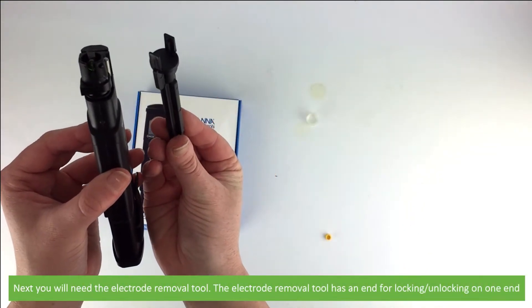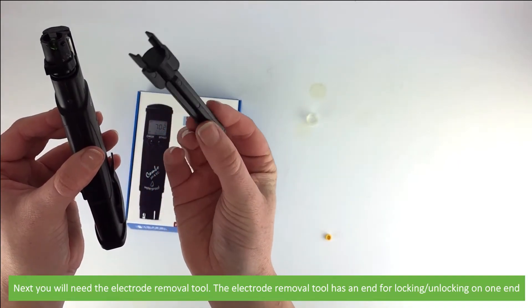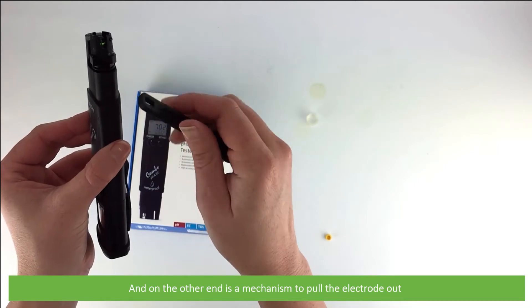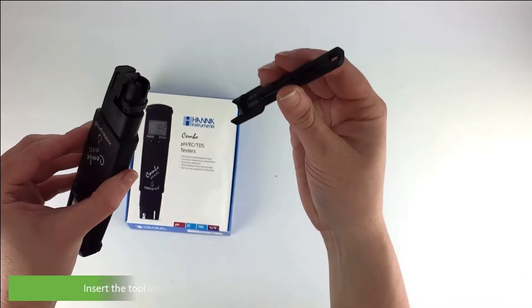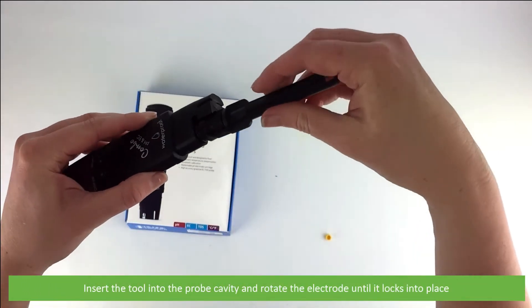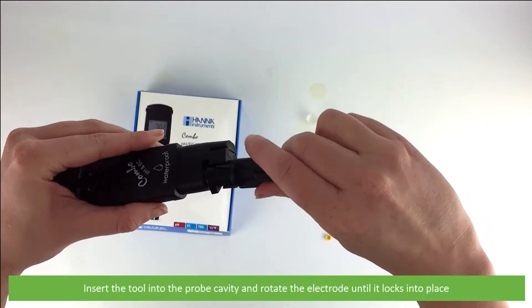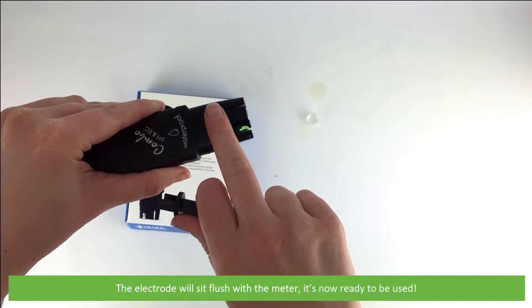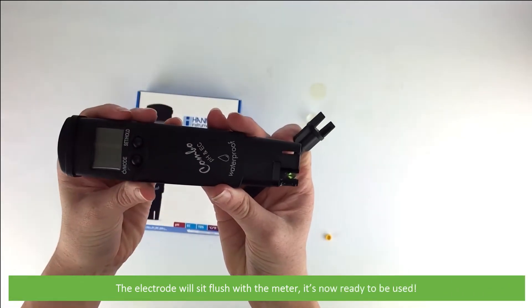Next you'll need the electrode removal tool. The electrode removal tool has an end for locking and unlocking, and on the other end is a mechanism to pull the electrode out. Insert the tool into the probe cavity and rotate the electrode until it locks into place. The electrode will sit flush with the meter and is now ready to be used.